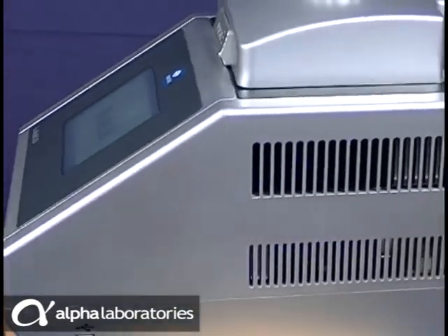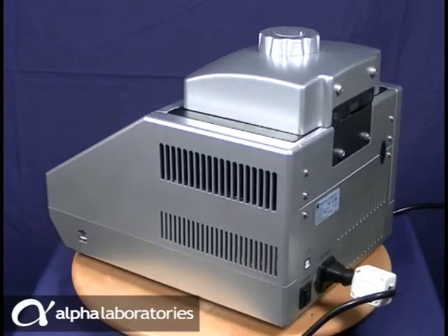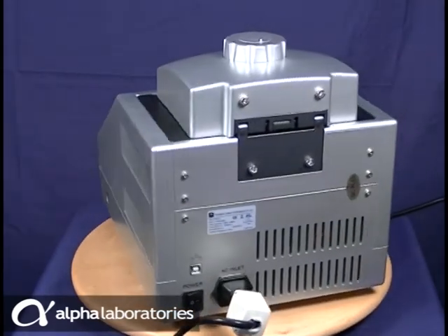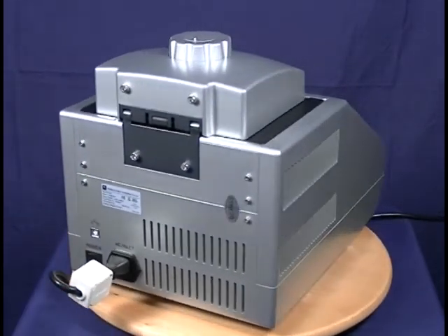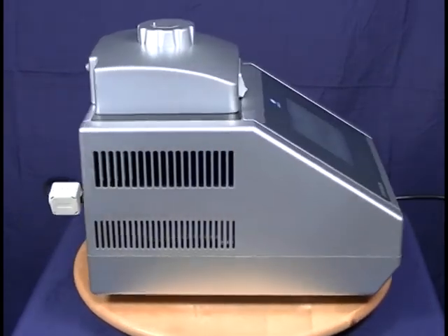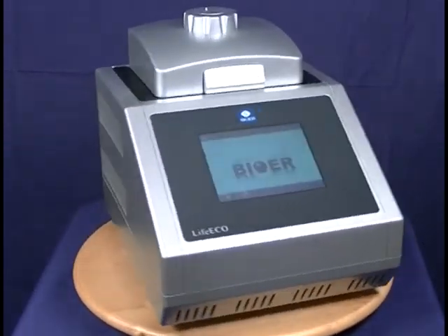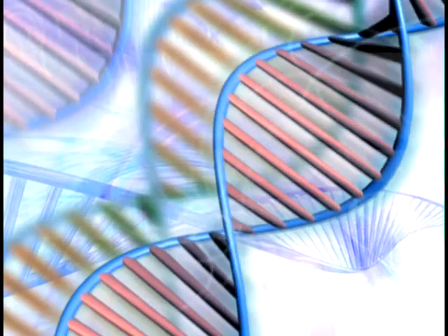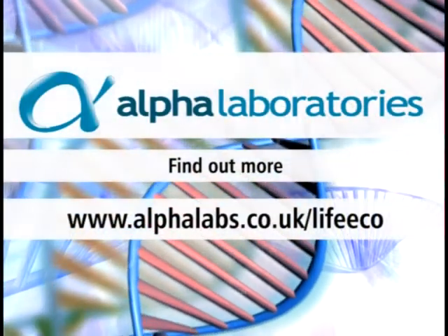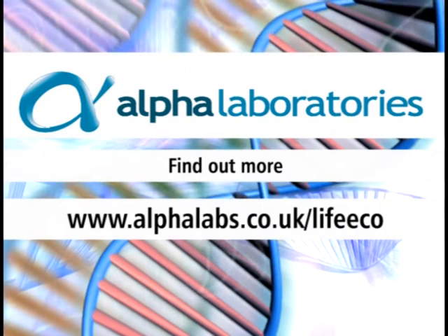So, as you can see, it is very easy to set up even complex PCR protocols using the LIFE Eco Thermal Cycler. This instrument is very affordable yet highly functional. It comes with a two-year warranty and a range of service packages are offered by Alpha Laboratories. Find out more about LIFE Eco at our website.